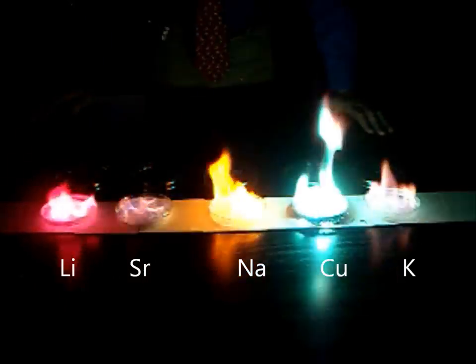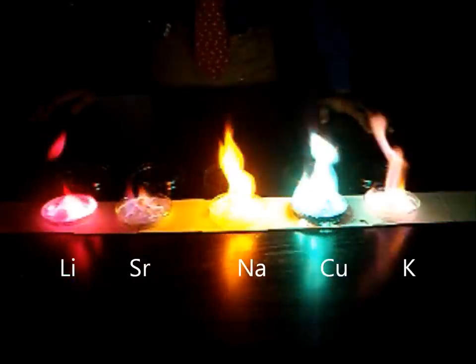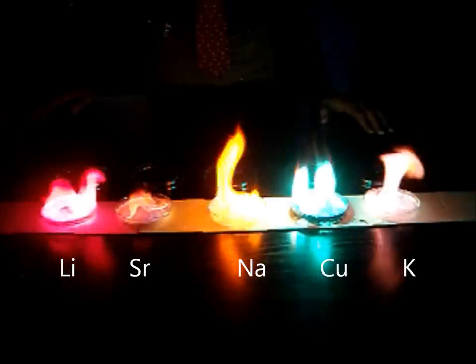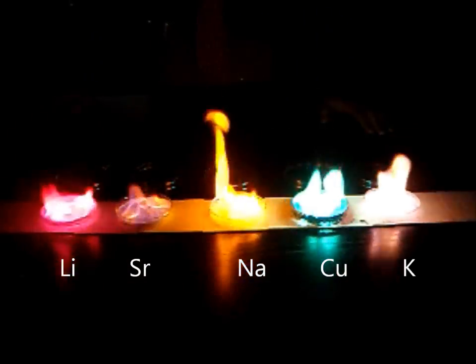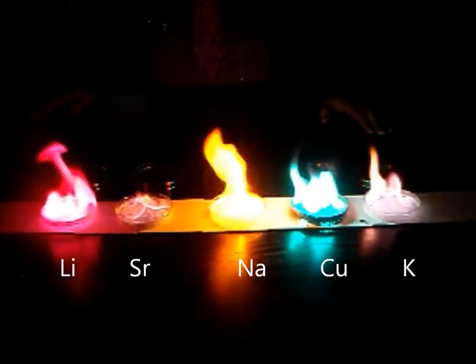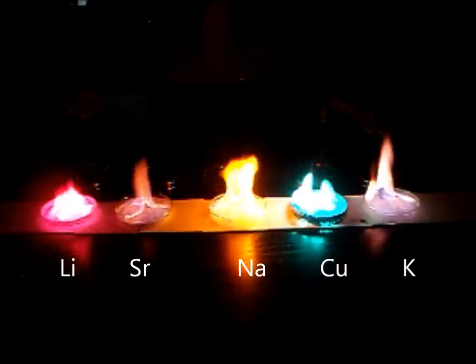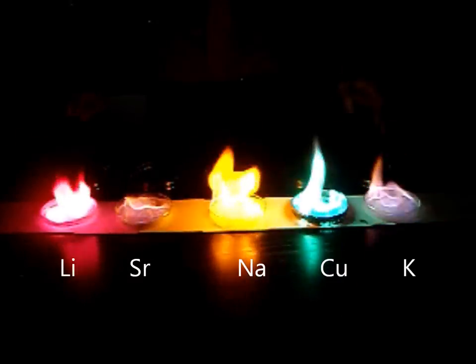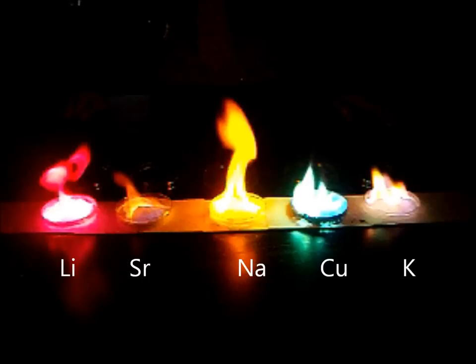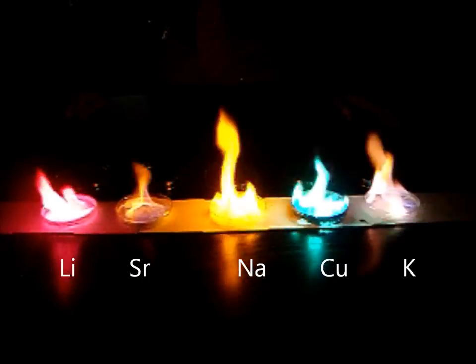The reason for the different colors is due to the different amounts of distance that the electrons fall as they go back to the ground state. Smaller distances falling mean a smaller energy light, such as the pink light of lithium. Larger distances, such as the purple light being put off by the potassium, are due to larger falls to the ground state.